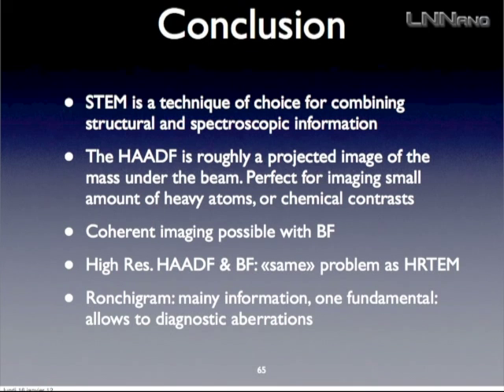You can make coherent imaging with bright field. I don't know if there is a bright future for it, but you can do it. When you begin to work at very high resolution, HAADF or bright field in a STEM have exactly the same kind of problem as high resolution TEM. You cannot avoid making simulations in that case. You cannot avoid knowing every relevant angle in your system, which are incidence and collection angles. You need to know exactly what the acceleration voltage is and so on and so forth, exactly like in TEM.